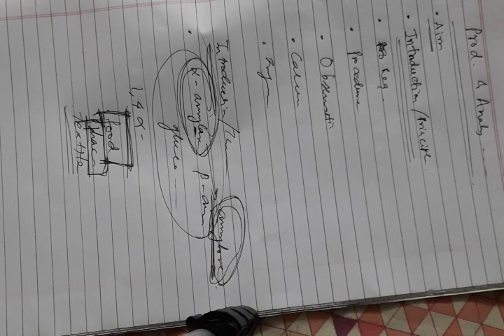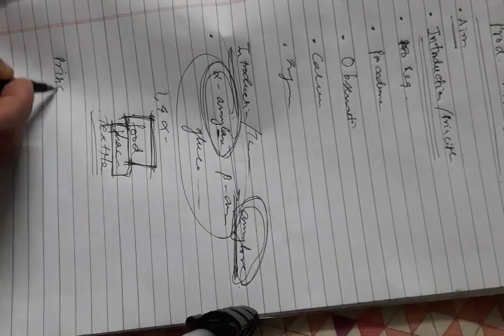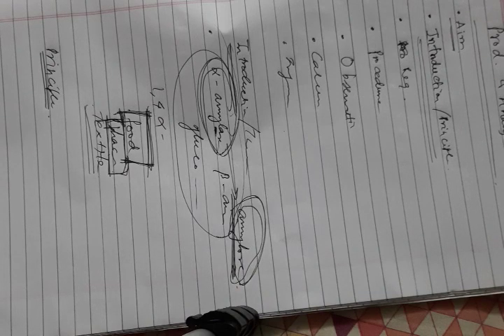This amylase is produced by humans in the salivary gland and from the pancreas, and different bacteria, plants, and fungi also produce it. And then I would go for the principle, that is, on what basis this is going to happen.